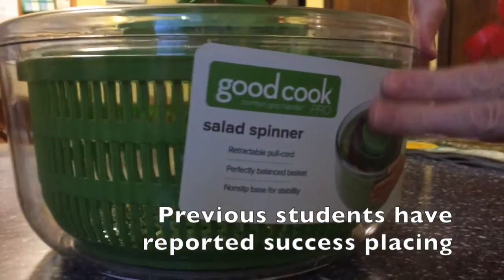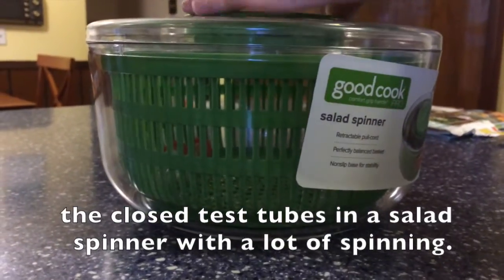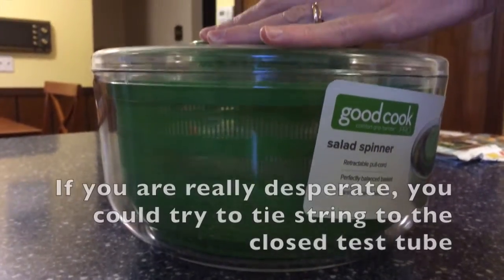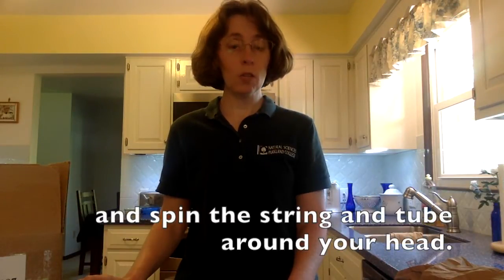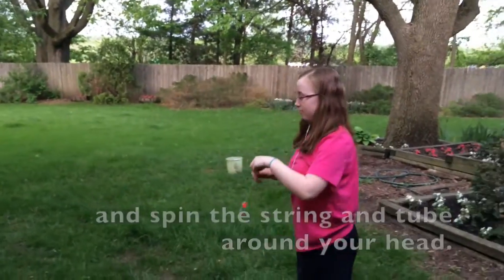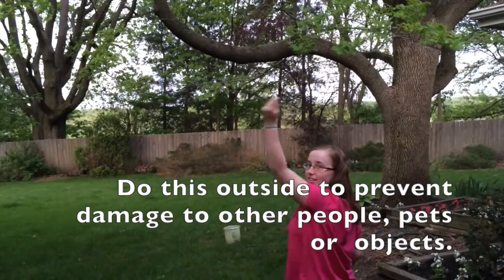Previous students have reported success placing the closed test tubes in a salad spinner with a lot of spinning. If you are really desperate, you could tie string to the closed test tube and spin the string and tube around your head. Do this outside to prevent damage to other people, pets, or objects.